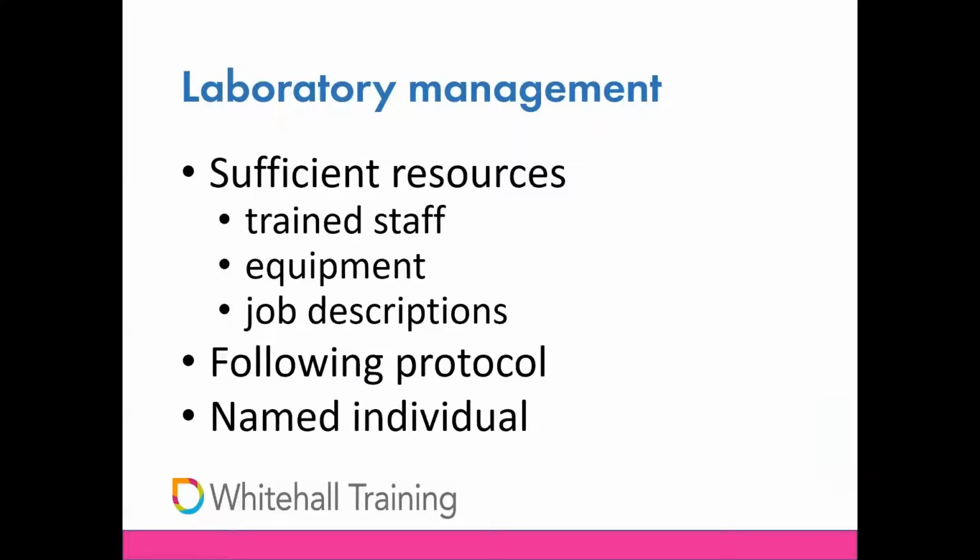Do all the staff involved in the clinical analysis have up-to-date job descriptions? And there should be a named individual overseeing the analytical work. They're probably going to be called something like an analytical project manager. The naming isn't important, the role is important. Now, their role is to ensure that everything is done in accordance with the protocol, standard operating procedures, contracts, etc., etc.